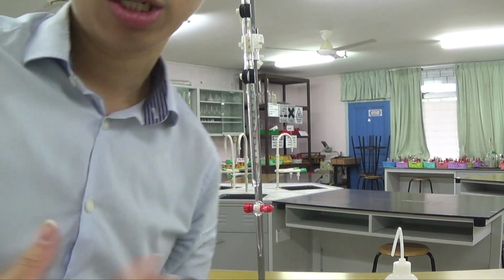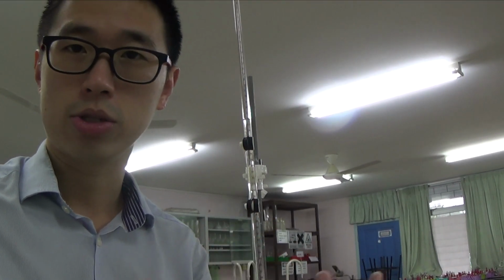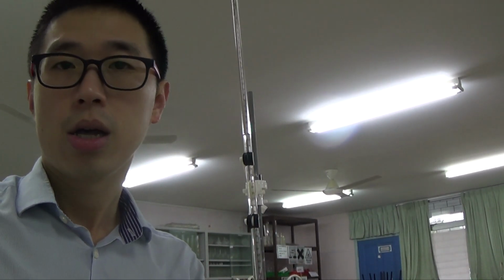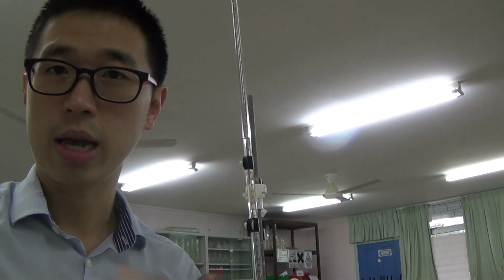A lot of teachers, a lot of instructors would probably advise the student to start from an easy number like 0.0 or 10.0 or 5.0. There's no certain advantage to it, it just makes it easier for you to have the same starting point every single time. But experienced chemists will know that it's all about the volume that matters.